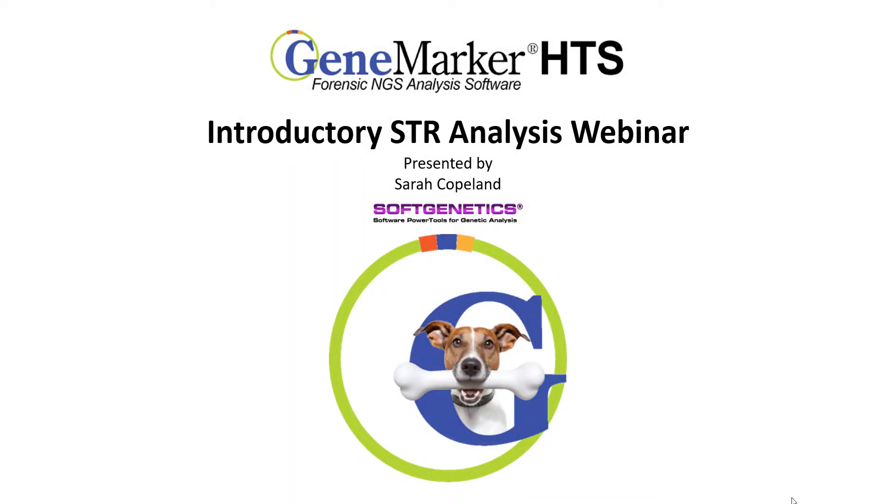Hello, my name is Sarah Copeland, and today I'll be giving an introduction to NGS STR data analysis using GeneMarker HTS software.